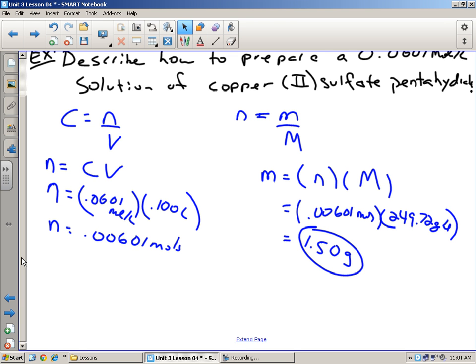Look at this one here. This is a beaker, okay, just a beaker. But this one does 10, 20, 30, and 40, supposedly. I'm going to tell you right now, though, this does 10, 20, 30, 40, not very accurately, because remember what happens when you go to measure volumes is you have to look across and get a meniscus, right? Well, look at how big that opening is. So that's a long way for the water to spread out.